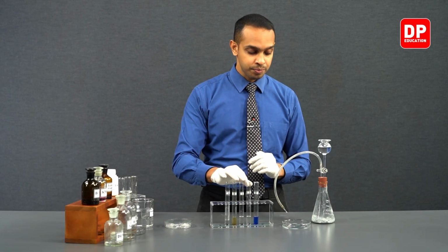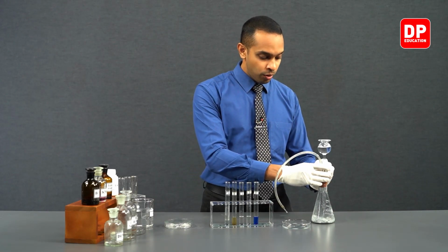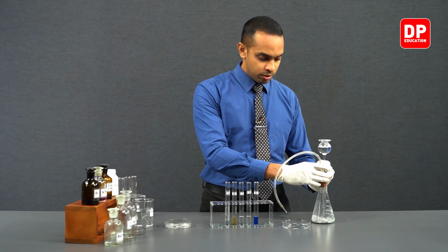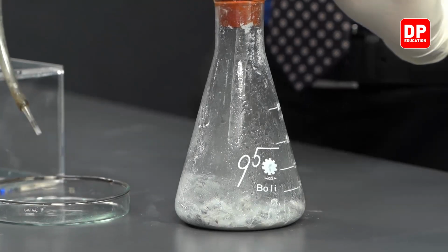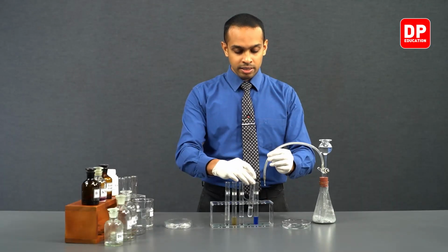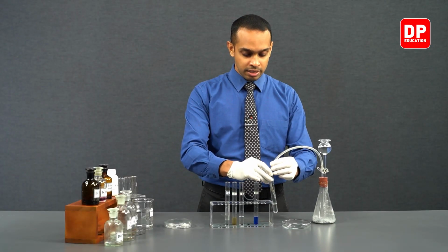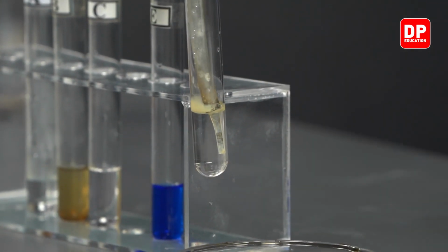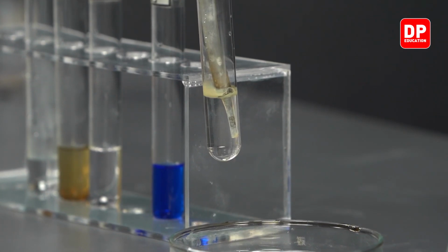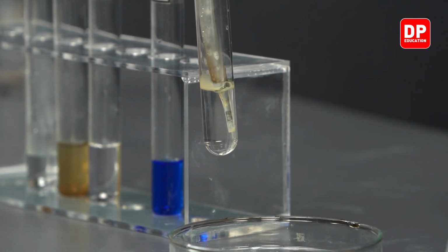So let's add a little bit of water to the calcium carbide that we have here. And as acetylene gas is produced, let's introduce that into our ammoniacal silver nitrate.